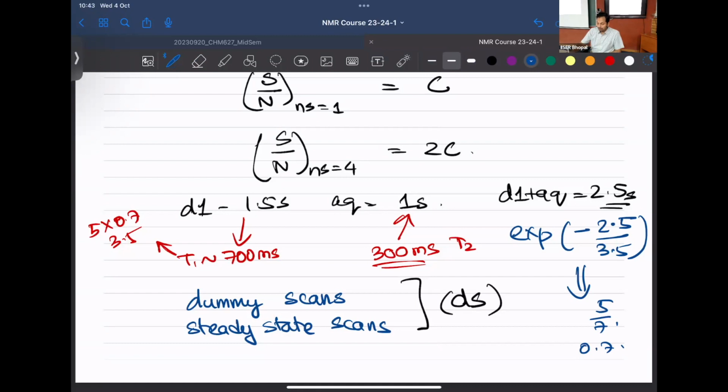So therefore, what you realize is that the first scan had 100%. The second scan, let's assume this number is 80%. You just had 80%. So what will happen if you co-add the FID from 100% initial equilibrium to 80% steady state equilibrium? The spins that have different T1s, when you add up, the integrals won't work out properly. So what you do is that the first experiment, you hit it at 100, then don't acquire the signal, you go to 80, or let's say you go to 90.